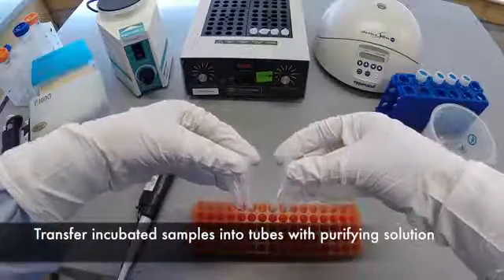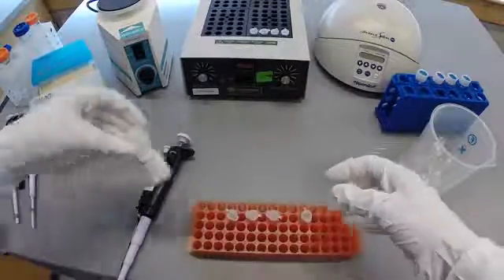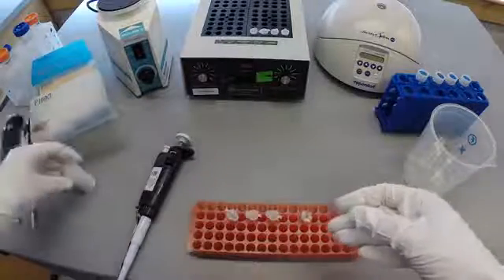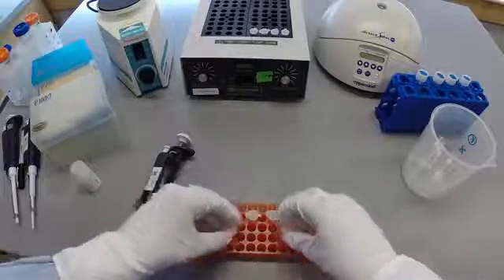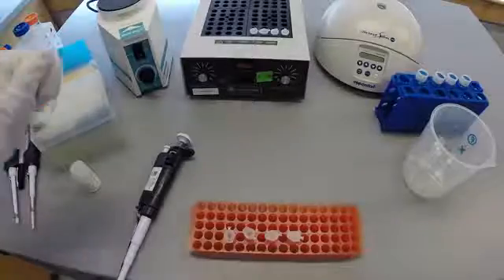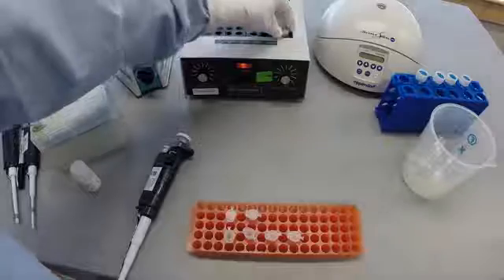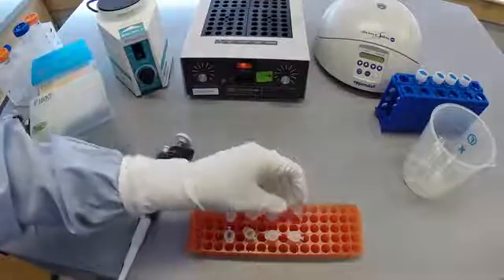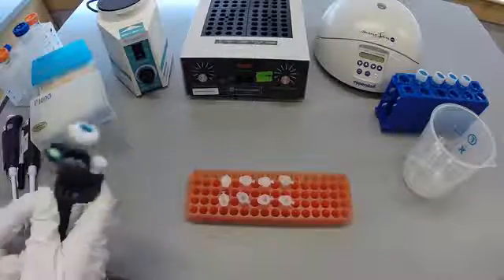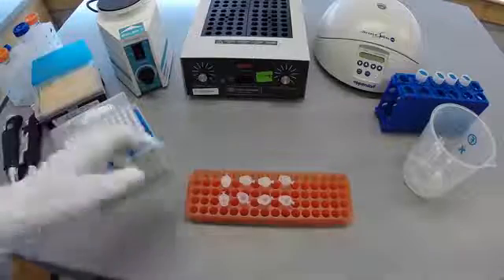Tubes containing 20 microliters of DNA Genotech's proprietary purifying solution, PrEP-IT, will be provided. Once the samples have been incubated, you will transfer the entire volume to a tube containing the purifying solution.